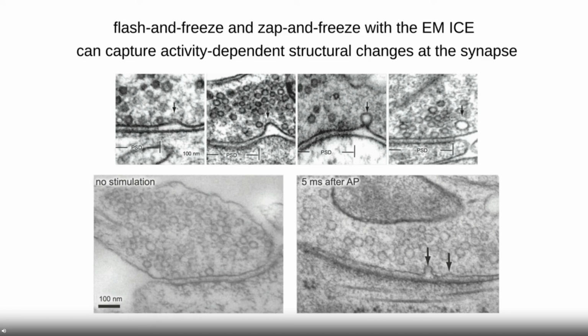I haven't talked at all about the postsynapse. There's lots of things you can capture there. You really never know what you're going to see, and you really will wait to see what you can get at this beautiful amount of resolution with this temporal component added.